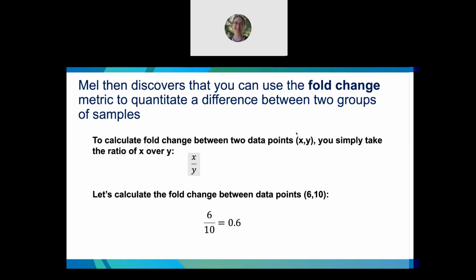The fold change by dividing will show that those are very different situations, that from 1 billion to 1 billion and 2 is almost no change at all. But if you're subtracting, there's no way to tell the difference. Both 2 to 4 and 1 billion to 1 billion and 2 would have the same fold change if you define fold change by subtraction.